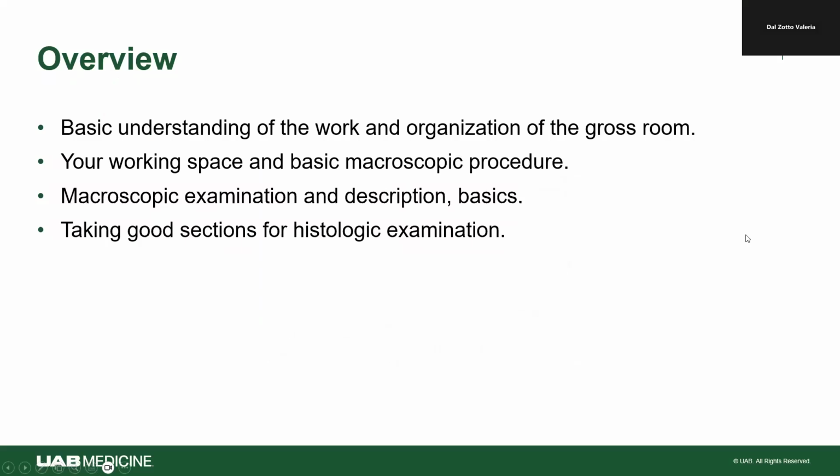All right. So basically what we are going to go over in this short lecture is the understanding of the work and organization of the gross room, how your working space is going to be arranged, and the basic macroscopic procedures that you have to follow. Also, we are going to go over macroscopic examination, gross descriptions, and all the basics. We also have some tips for taking good sections for histologic examination. All of this we are going to practice during the gross room lectures.